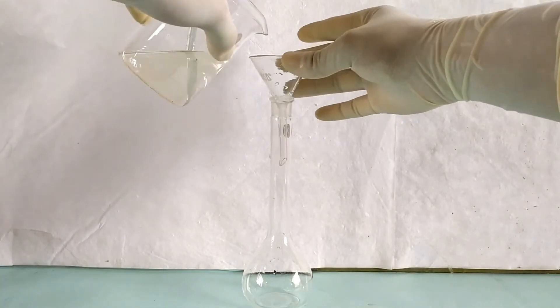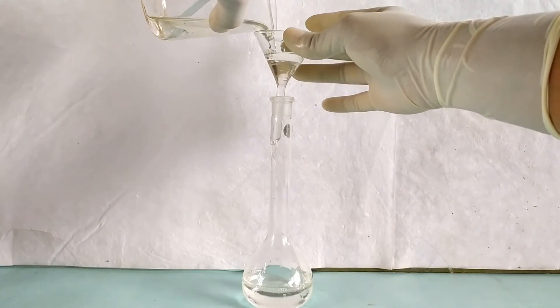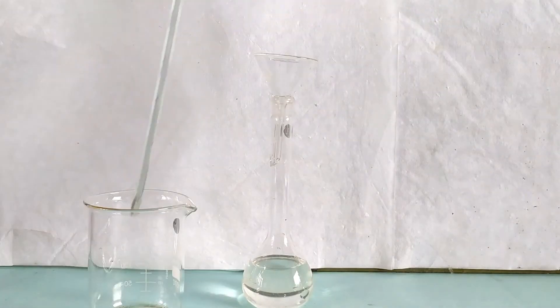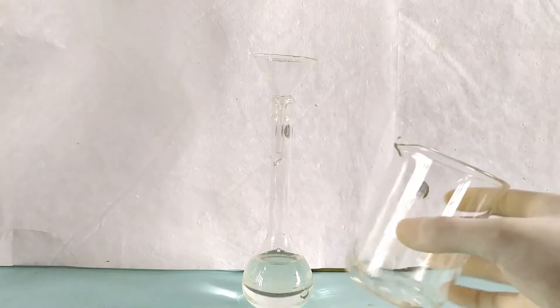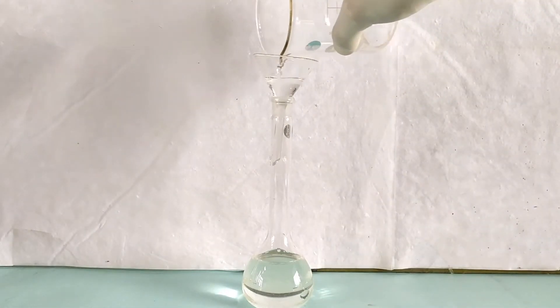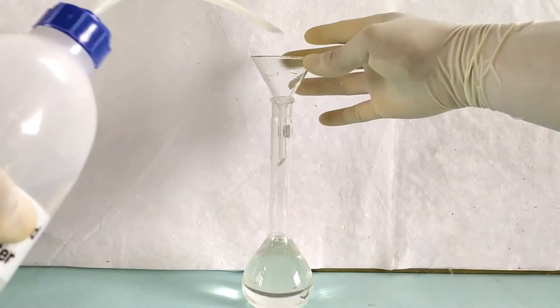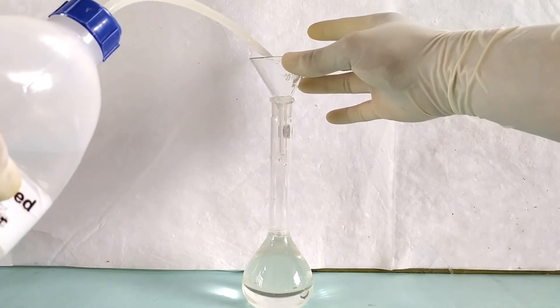Transfer the contents of the beaker into a 100 ml volumetric flask or a graduated cylinder. Rinse the stirring rod, the funnel and the beaker using small amounts of distilled water while making sure that the final volume after rinsing does not exceed 100 ml.